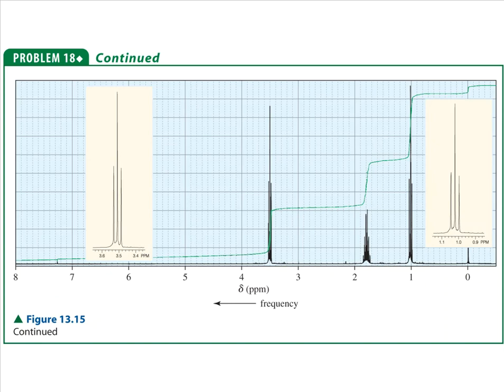All right, so let's start comparing these NMRs to each other. Notice I see a major signal here, and then a major signal there, and a major signal here. There's 3 big major signals on the NMR. What these other little things are, I don't really care right now. We've not talked about it, and we will, but just not right now. We don't need that information to answer this question, okay?